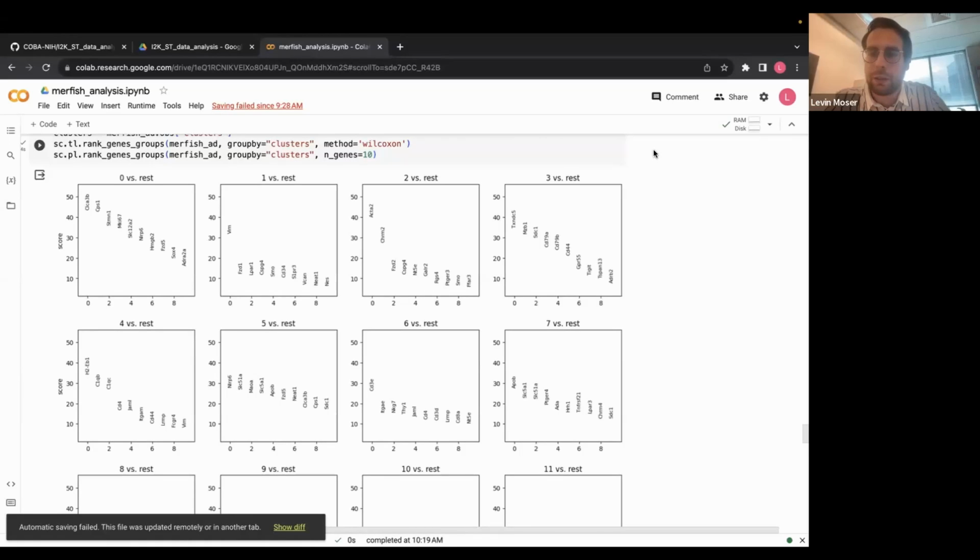Why do some have slightly lower scores while having higher ranking? Okay.